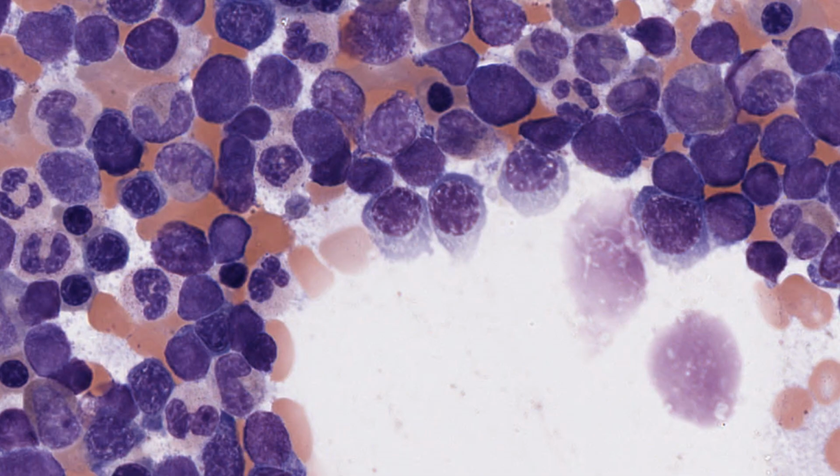Have an admiring look at this image. I think bone marrow is one of the prettiest tissues to look at using standard stains under the light microscope. You can see some mature red blood cells. All those small, pink, reddish or orange stained structures are erythrocytes. You can see in some a central pale region, indicating the biconcave disc shape of these very special cells. They have matured and are now circulating in the bone marrow and will eventually leave the bone marrow to enter into the general circulation.